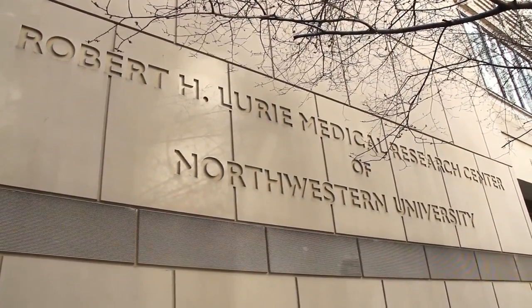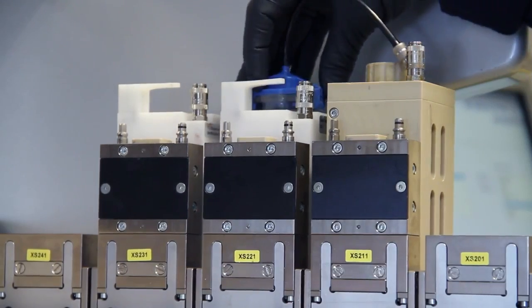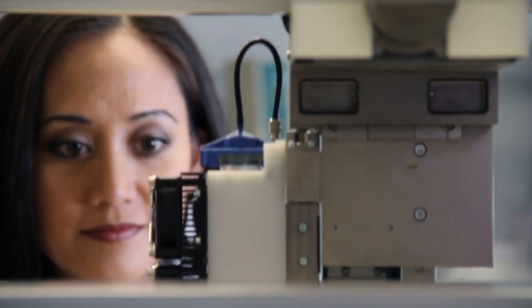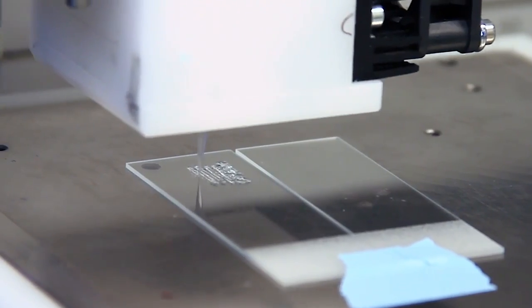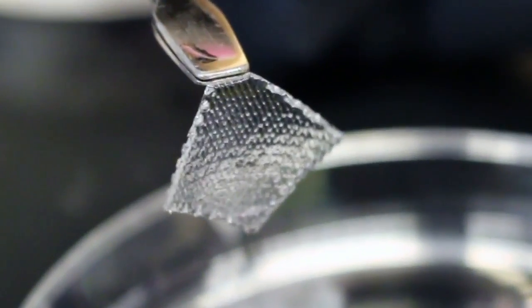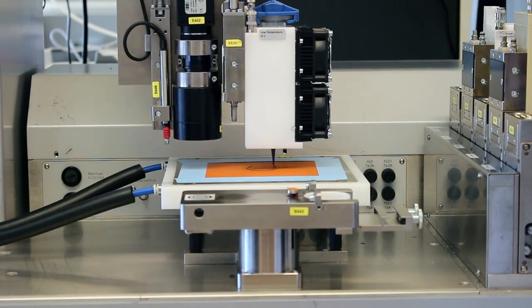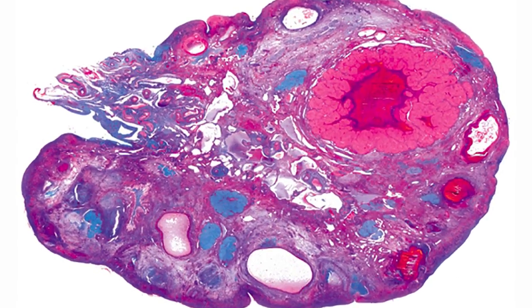My name is Shah, and I'm an assistant professor at Northwestern University in the departments of Material Science and Engineering and Surgery. My lab primarily focuses on developing new functional materials for 3D printing using a printing platform of direct ink writing. We have printable hydrogel systems so that we can create complex organ and tissue systems. And then we also have what we call our particle-based inks, where we have the ability to print metals to ceramics to biological tissues. One tissue type in particular that we're looking at is 3D printing an ovary bioprosthesis.